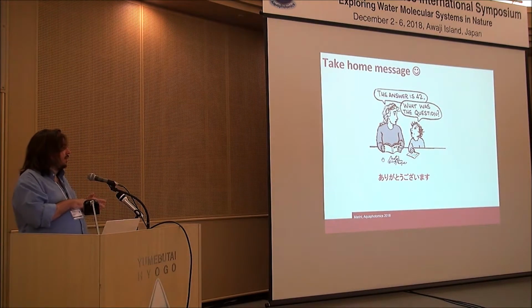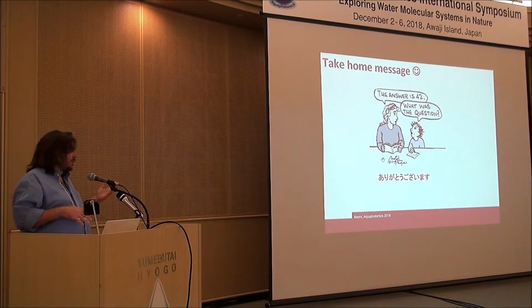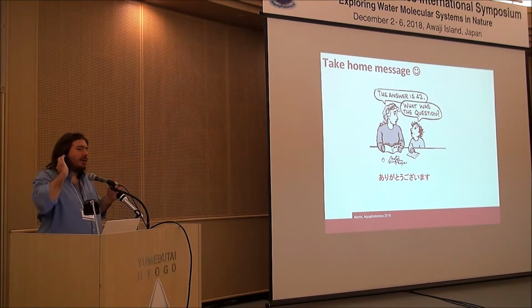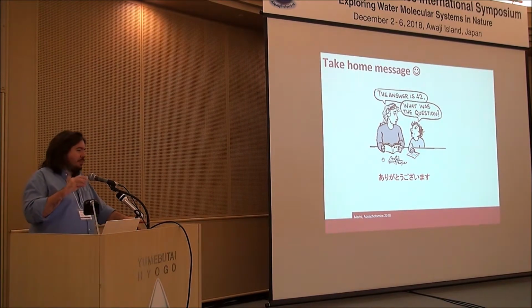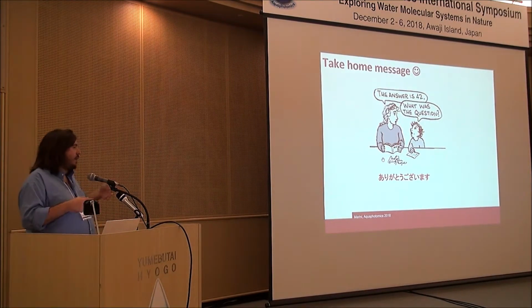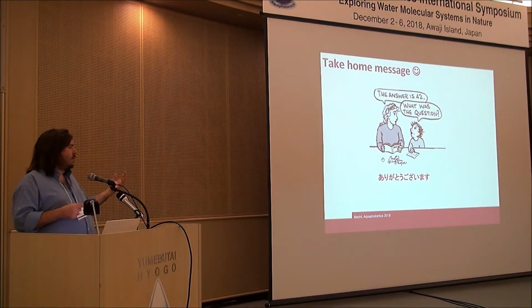So at first, with all the problems associated and with appropriate care, doing a PCA or an SVD of the data matrix would give you an idea of the optimal number of components.